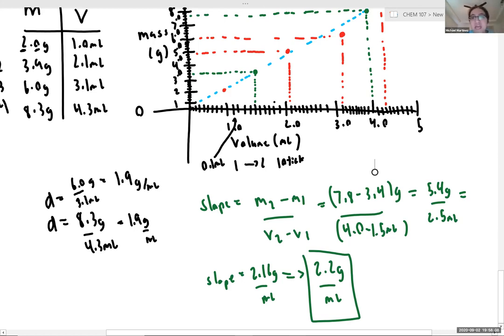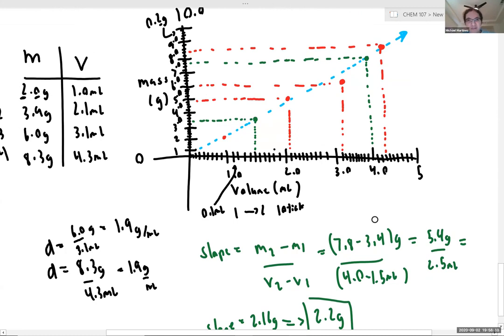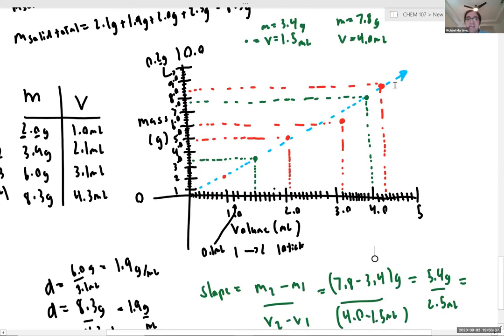So the best fit line that we've drawn is not perfect, but it's pretty close if you're using a ruler and if you're really careful picking your points from the line. You may notice that your average slope may be a little bit different than your best fit line, and that's just because the best fit line, when drawn by hand, may not be perfect. You can even check your work for your calculated slope using Excel. But I'd like you to practice graphing by hand, as it's a nice skill to develop, as it really helps you see trends in data and notice patterns.